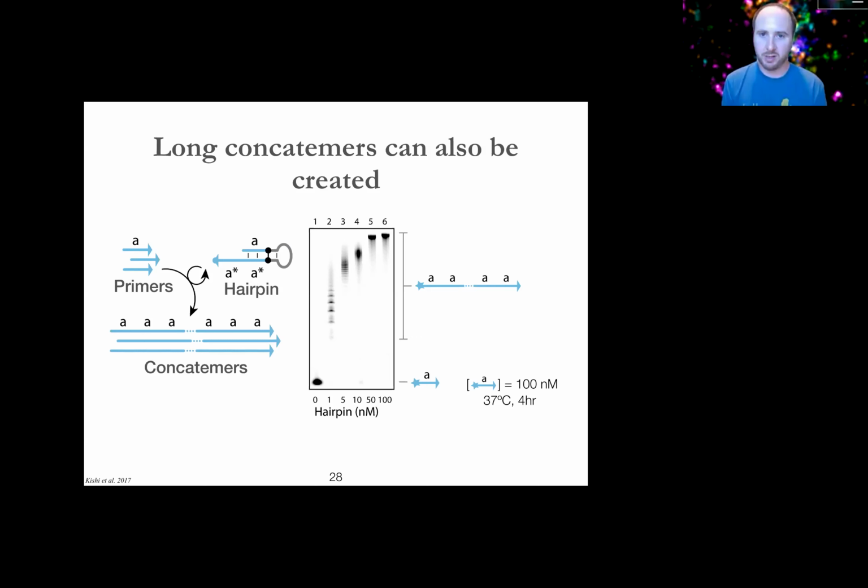I think the beauty of it is that this repetitive DNA is just a nightmare to get any other way. The only other way you can get this type of thing is by chemical ligation. If you ask an oligo company to make this, they'll probably just laugh at you or get really sad, because synthesizing these things on a column with their repetitive nature over the length scales we're talking about is just a nightmare, and no one's going to want to do it. So what Josie really has done by introducing PER is make a really nice framework in a molecular biology sense to synthesize these very difficult molecules very easily.